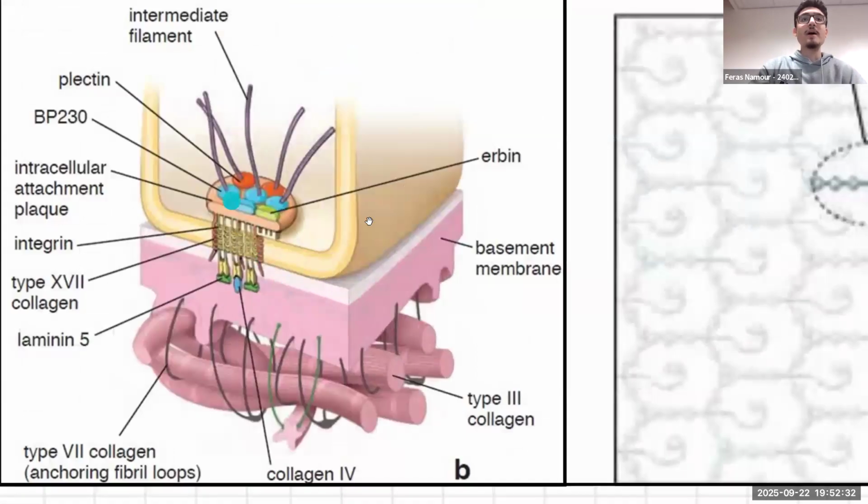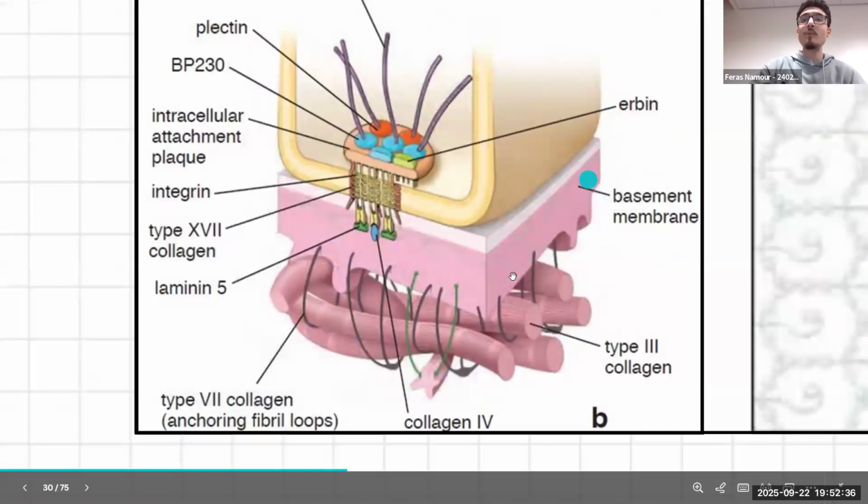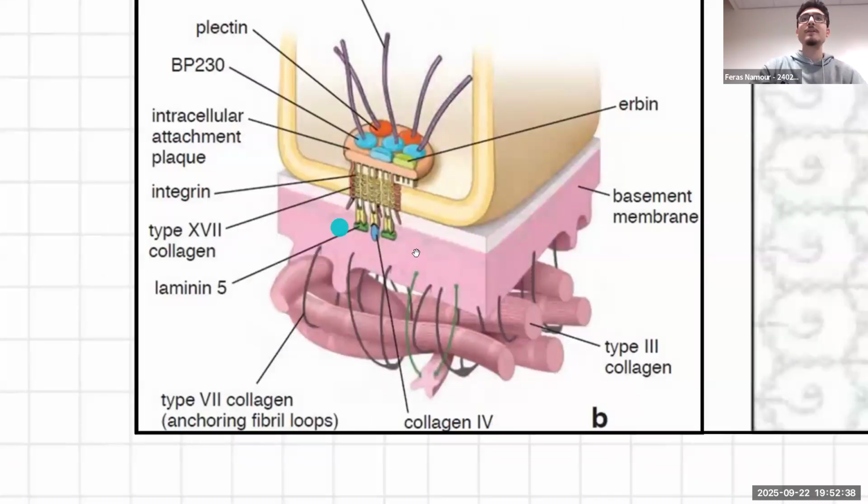Then we're going to take a look at my reticular basal membrane. You see how my basal membrane, basal lamina here is very thick and connected? My reticular is more so fibrous, less dense. Here is my reticular basal membrane, and here's my basal basal membrane. My reticular is made out of type 3 collagen. My basal membrane is made out of type 4, and it's made out of laminin and integrin binding.